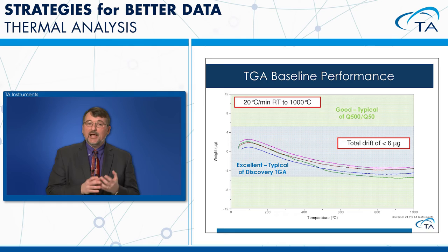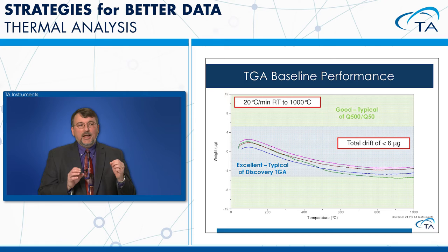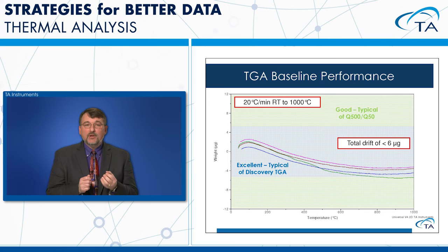For TGA performance, we look at weight drift as the furnace heats up. Plotting weight in micrograms, ±5 micrograms around zero is excellent performance, expected from the Discovery TGA. A Q500 or Q5000 will be wider. The key question: if my TGA has 50-microgram drift and I need to measure a 10-microgram weight change, that's impossible — but with only 3 micrograms of drift, that measurement is achievable.